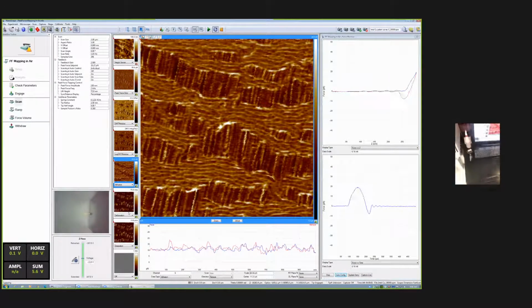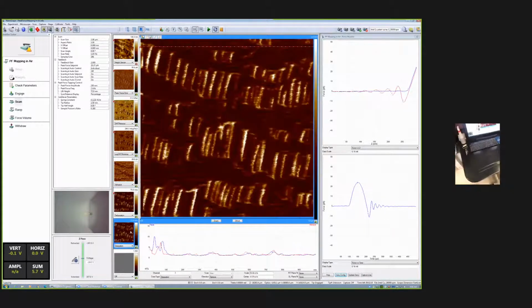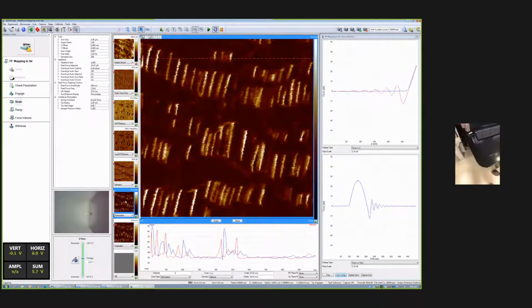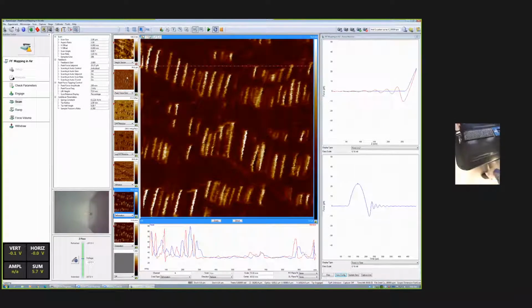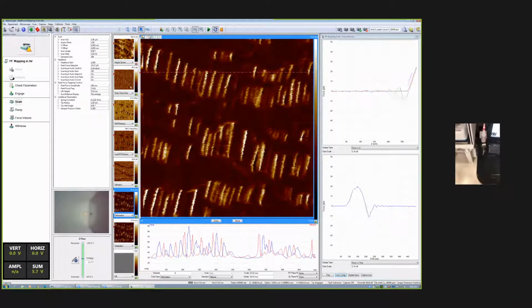There's a whole bunch of channels, which you can see on the left. There's a vertical panel of 8 different channels. You can click on whichever ones you want, Mike. This is what's called the dissipation channel, how much energy is being dissipated. There's a channel called deformation, where we can look at how it's deformed. You see that a lot of them are similar because it's the same type of structure, but it allows us to map out these mechanical properties of a material with very, very high resolution.